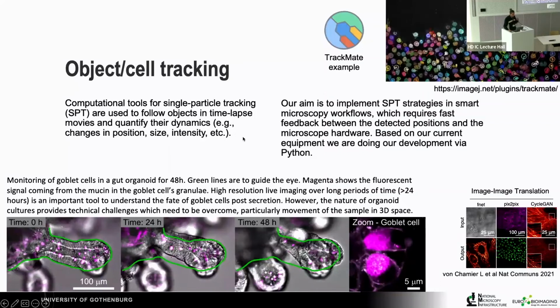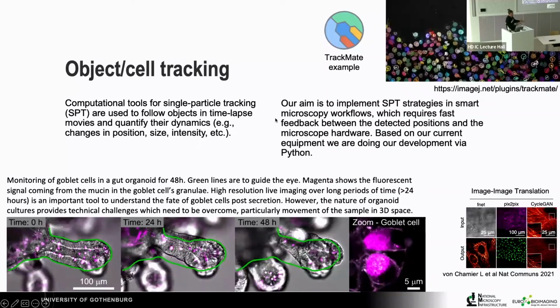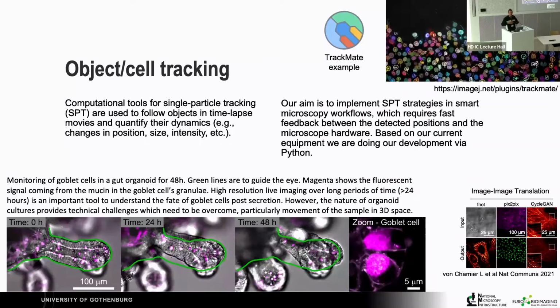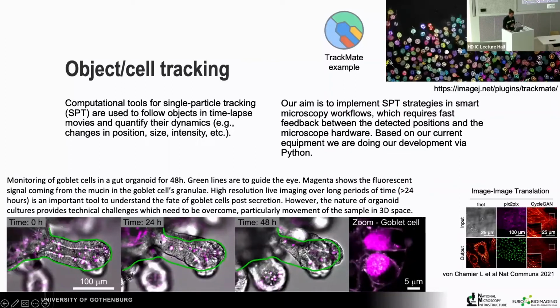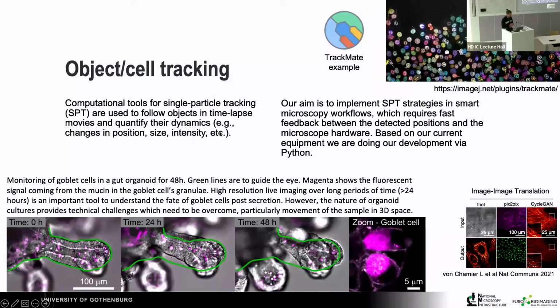Now, what we want to do is that we want to also use these strategies of single particle tracking on workflows that will adapt to, for example, where the cells are moving. Perhaps there is a subset of cells that I want to follow, so the field of the microscope adjusts as the cells are migrating.